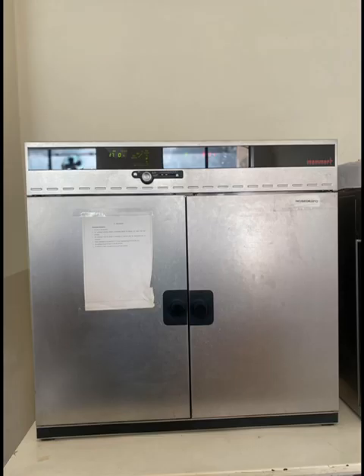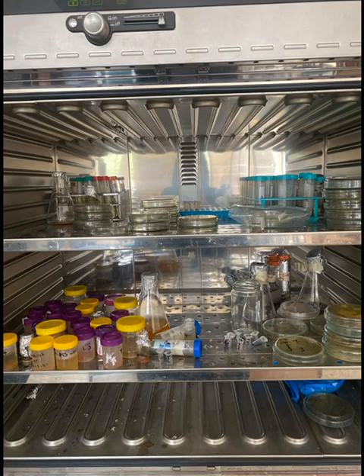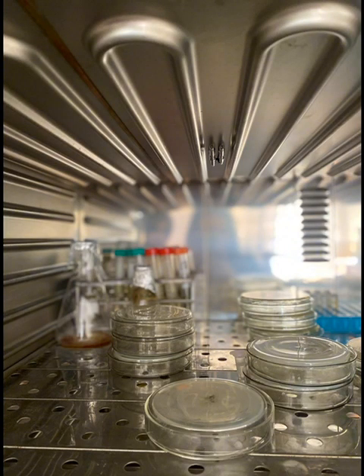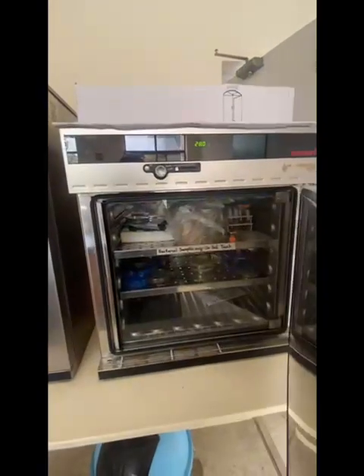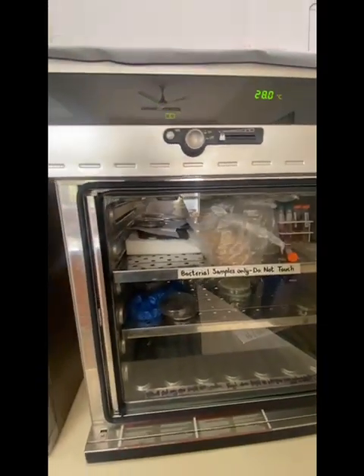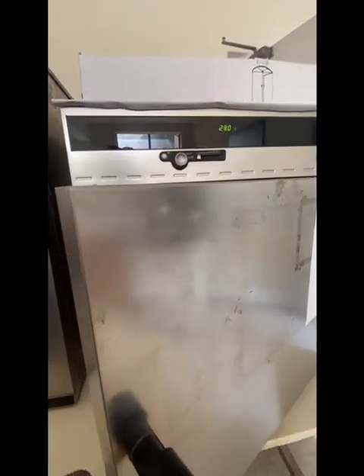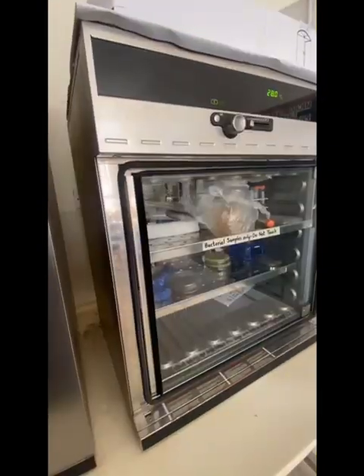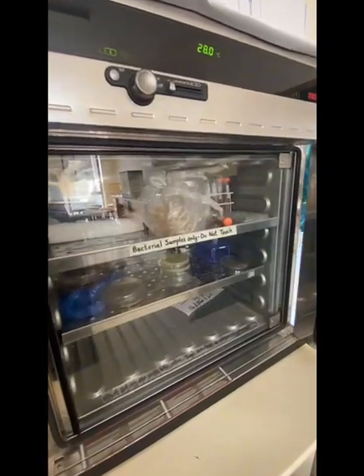Advanced growth incubators are equipped with sensors to monitor temperature, humidity, gas concentrations, and other parameters. They also have alarm systems to alert users in case of deviations from the set conditions, helping to prevent damage to cultures. Growth incubators find applications in various fields, including microbiology, cell biology, tissue culture, pharmaceutical research, biotechnology, and clinical diagnostics. They are essential for maintaining cultures for experiments, production, and testing purposes.